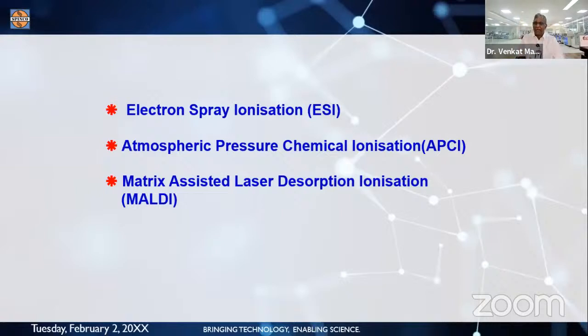If you have got a method, your US Pharmacopoeia says, or Indian Pharmacopoeia says, potassium dihydrogen phosphate has to be used, convert that to an equivalent volatile buffer method for using in liquid chromatography cum mass spectrometry. It is possible. A table is available. When we see the application method development, I will explain all those things in detail.